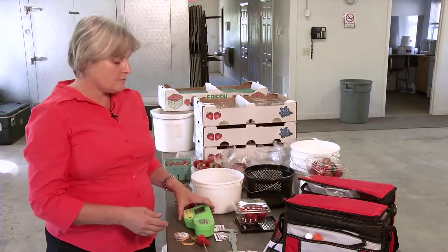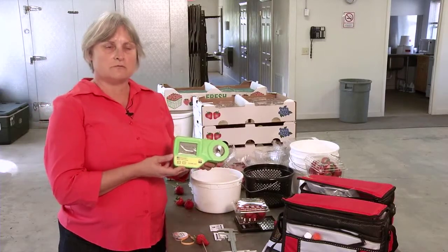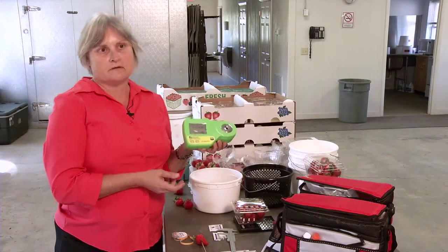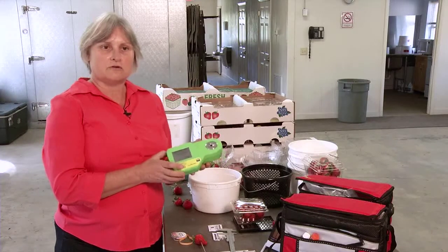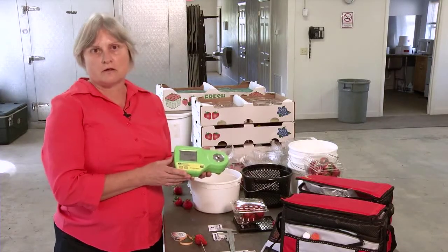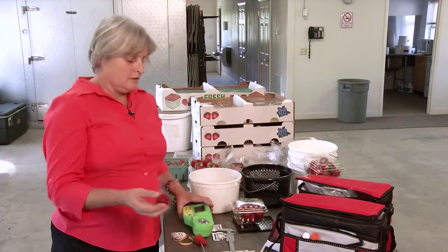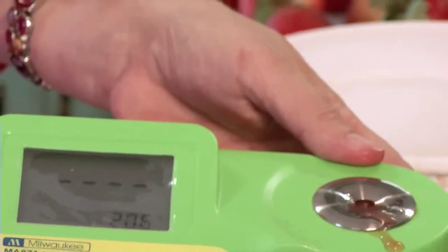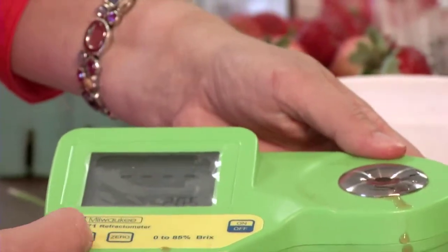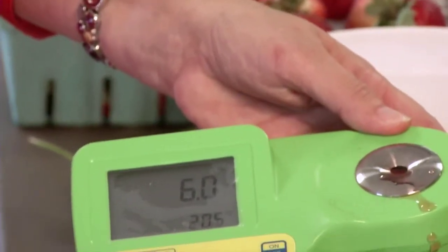Starting with the most important and probably most expensive item: this is a sugar meter. It will measure your soluble solids. These used to be a $300 item, and they still are, but this one is made in North Carolina and costs about $93 online. You take your fruit, get some juice on it, cover up this little hole right here, and you can read it. About six or seven percent sugars in a strawberry makes for a pretty nice flavored, pretty sweet strawberry.